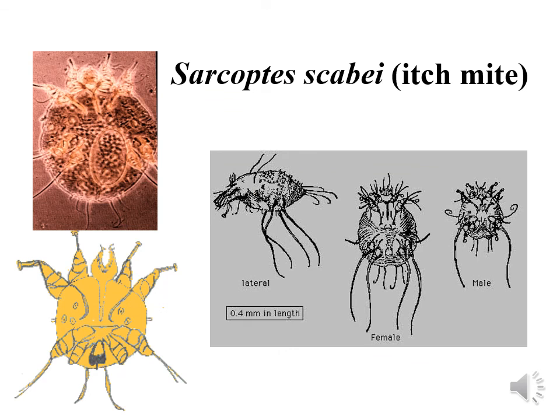There is what's known as the itch mite, Sarcoptes scabiei, and this causes a sort of dermatitis known as scabies, which in colloquial Arabic is known as al-jarab. Usually, scabies is more common among animals, not humans. The itch mite has clumpy, short limbs and some hair structures.